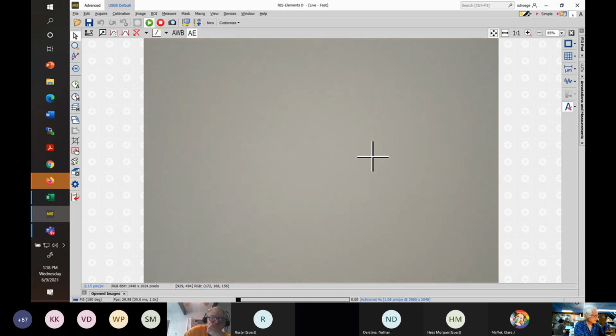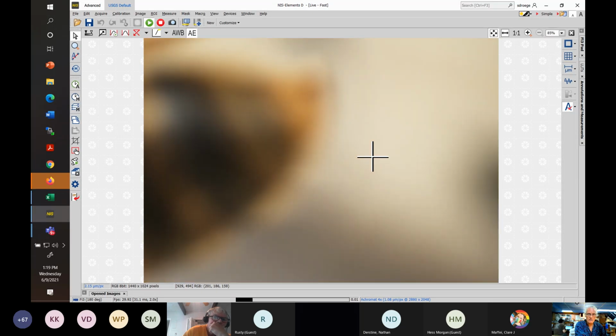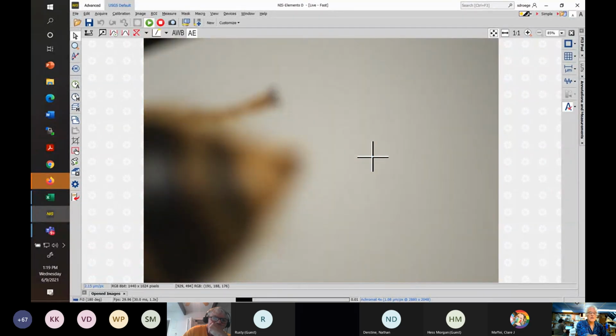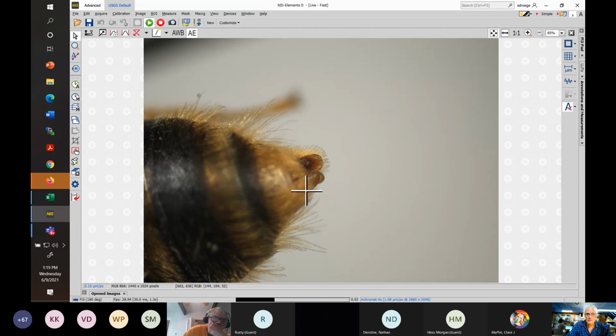One reason to spend a little time on S8 is it's often a little tricky to see. We want to have something that's clearly visible, so that you get familiar with what it looks like and can find it when it's not as accessible. So this one is. Notice, same species, but the genitalia, which this is maybe part of, are retracted. So this would be the normal state for a male Andrena specimen. This is the mysterious S8.